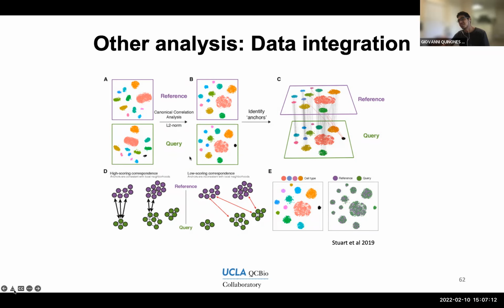The way you can think of this is that for a cell over here, I calculate the distance of this cell to all other cells over here. And it's actually closest to a cell over here, right? So we can come up with a new measure of expression that reflects the similarity between the two cells. And then when you perform this, you obtain a new set of clustering where the position of the clusters is a lot more similar now between your reference and your query.